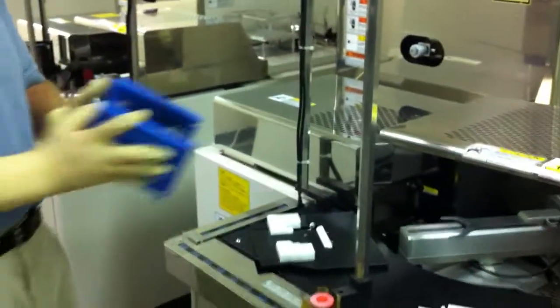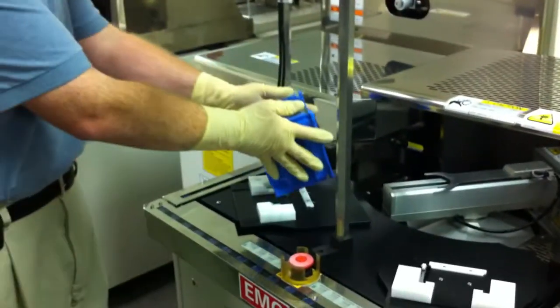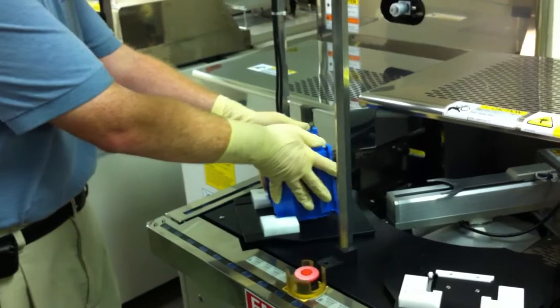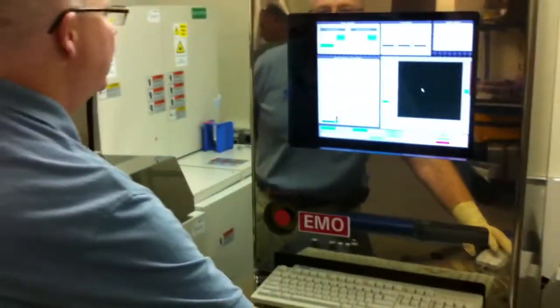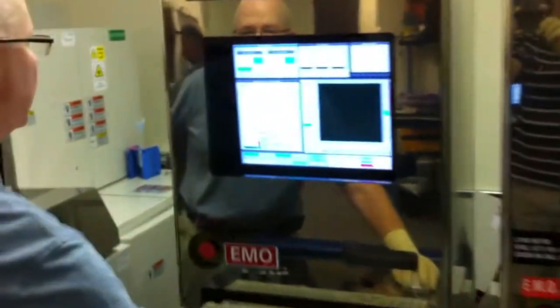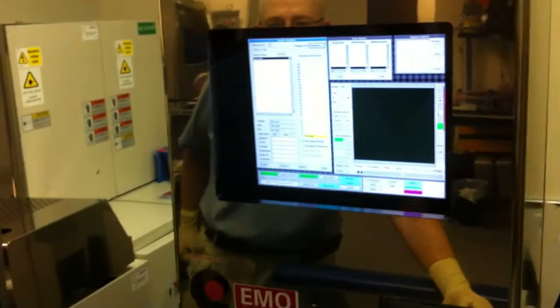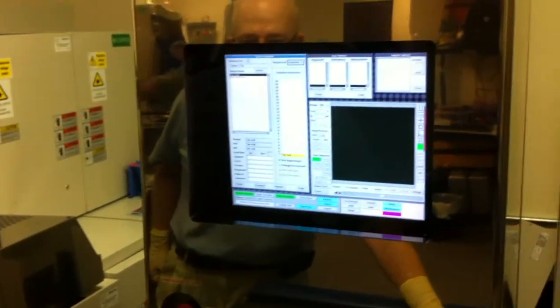We're going to go ahead and load up a wafer, so go ahead and put your boat down right there, and then we're going to start a recipe by selecting Execute.